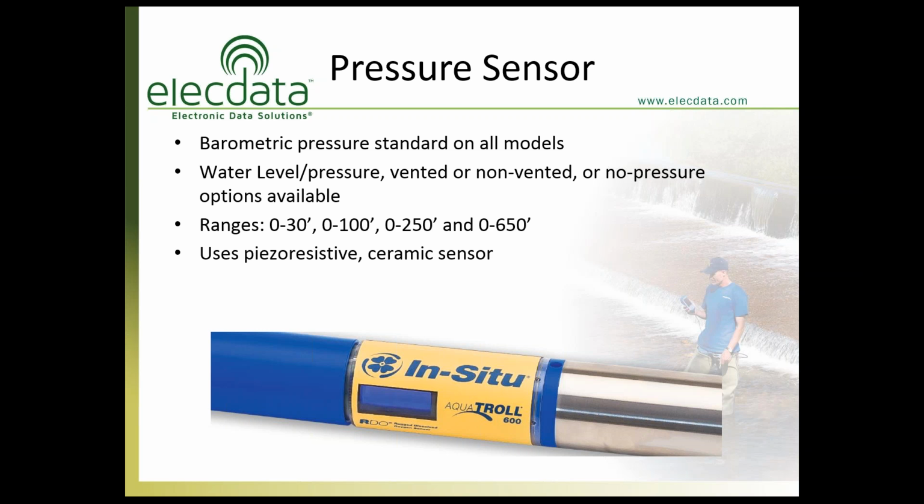The other thing that the barometric pressure does for you, if you're a person that likes working with a non-vented or absolute type of pressure sensor that's reading total pressure, is that the barometric pressure sensor in the sonde measures the local barometric pressure and automatically subtracts that, or compensates your absolute pressure reading for what the local barometric pressure is at the site. So very useful to have that.